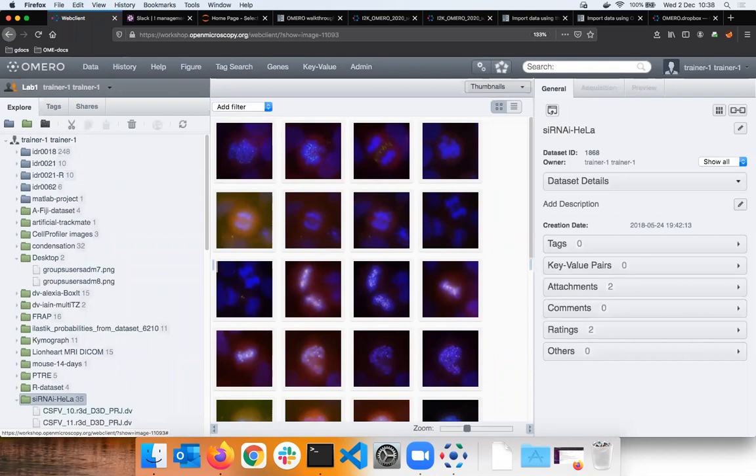If we have a folder that contains folders of our users, and each user has their own folder, we will end up with one big folder with all the data? No, no, no. You just saw that I imported it manually into specific kinds of subcontainers, and they are created in the OMERO sense.